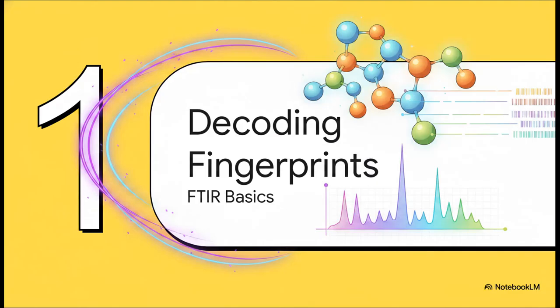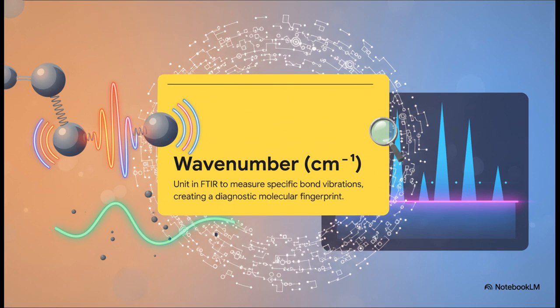All right, kicking things off with Section 1, decoding molecular fingerprints. Okay, so the whole mechanism here basically boils down to tracking how specific bonds vibrate at really specific frequencies when we expose them to infrared light. We measure these frequencies in a unit called wavenumbers.